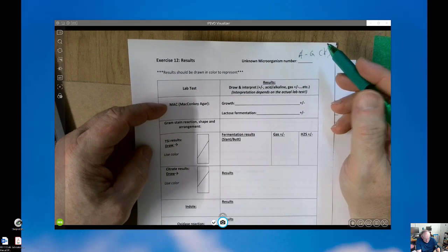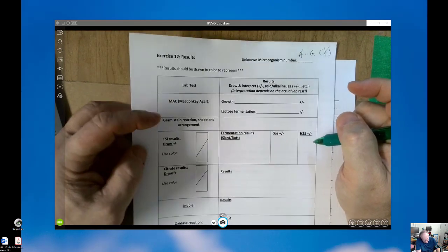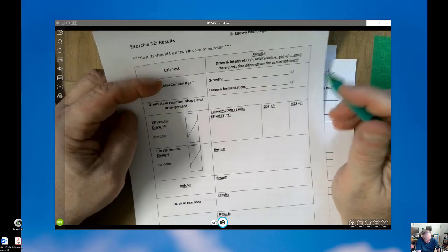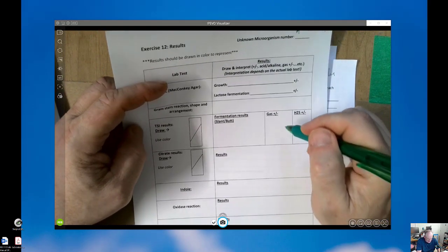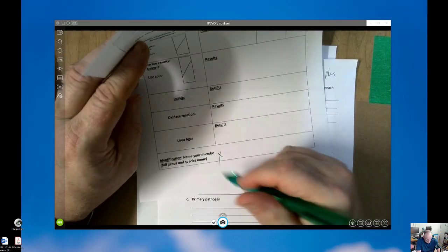So you can identify the organism and you can score it for the results. I give you virtual results with the tubes and various reactions for each of the letters, so you can fill this out, and then I give you a chart that has the results for the organism based on the various tests, and then you can just identify it here down at the bottom.